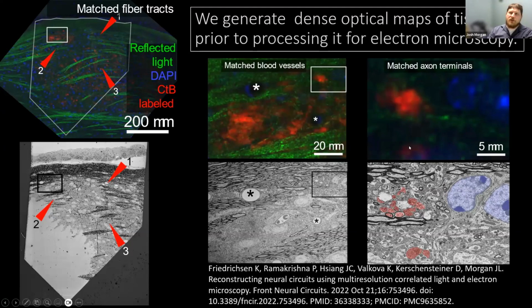Most of this can be done manually, but as you get down to finer and finer scales, you might need some kind of assistance. So we had in one of our last projects kind of a semi-automated pipeline where we would find the transformation, tweak the transformation, and find more correspondence points.